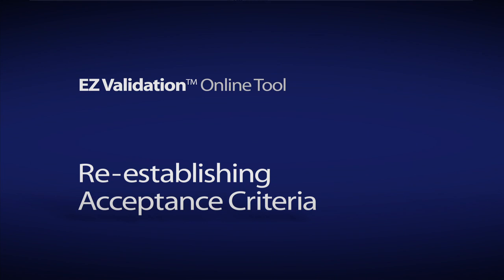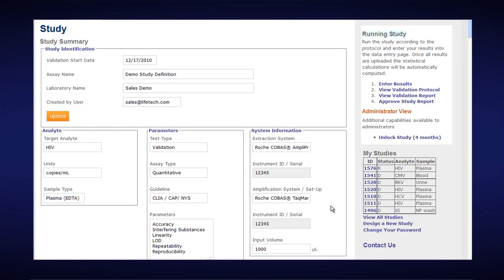Re-establishing acceptance criteria. The EZValidation tool gives you the flexibility not only to put in individual acceptance criteria for every point in your studies, but also to change the acceptance criteria if you need to. As is best practice, the acceptance criteria are set prior to running your experiments, when you're creating your study.